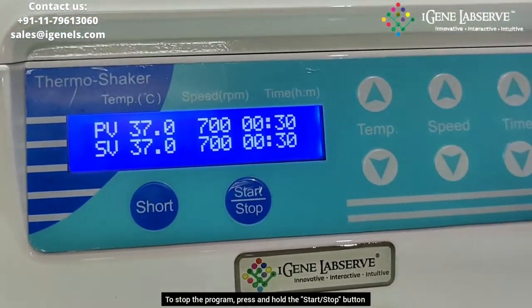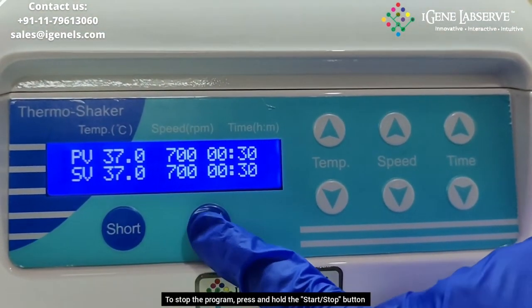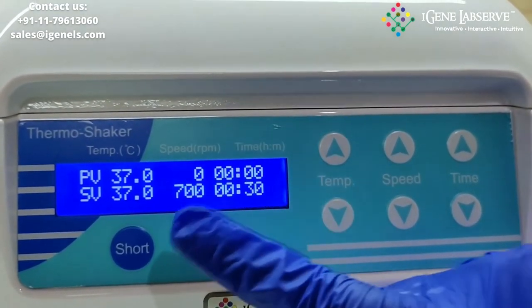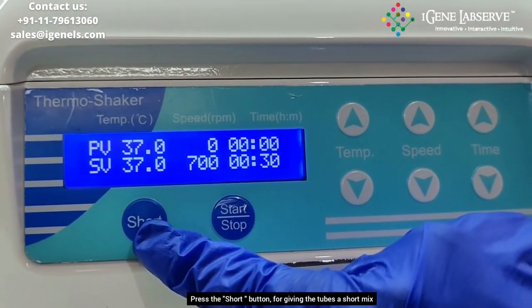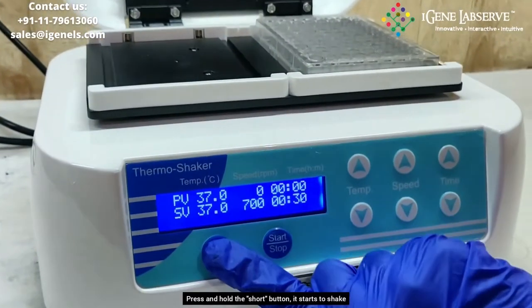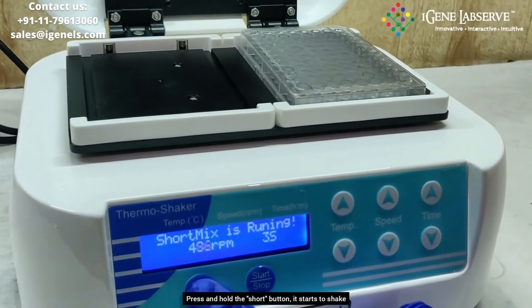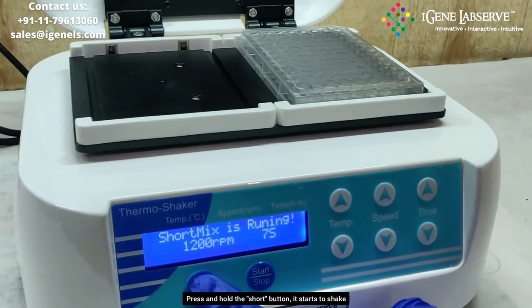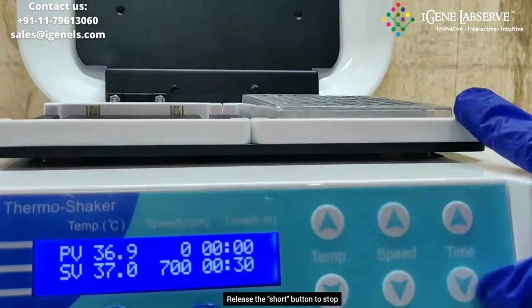To stop it, you have to again press the start and stop button, and it stops. This particular button, which is the short button, is for giving it a short mix or short spin. You have to press this button and it starts to shake until you release the short button, then it stops.